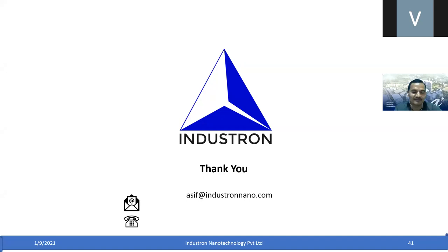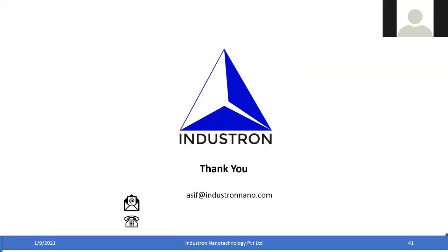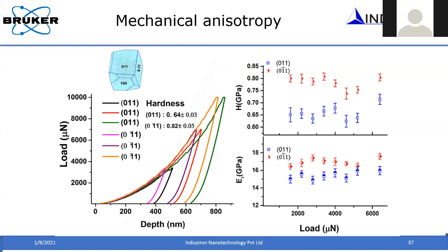In one of your studies, you have shown your indenter size bigger than the sample. So how reliable is the data that you get in those cases? Normally with the sharp tips that we are talking about, the typical tip radius of curvature starts at about 100 nanometers, and with sharper tips about 30 nanometers. But the tips can be changed to whatever shape you want. Sometimes you can have a pyramidal tip, a spherical tip, or a cylindrical tip, depending upon the application.